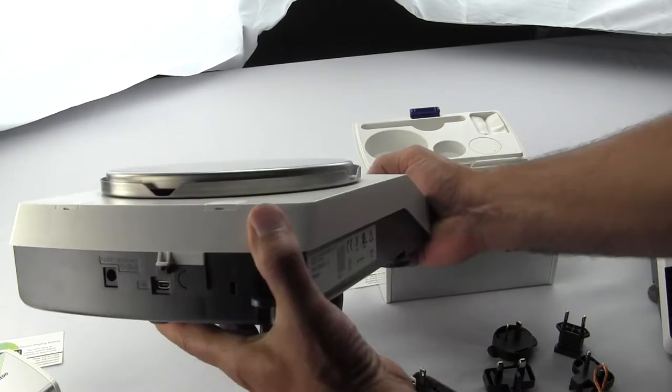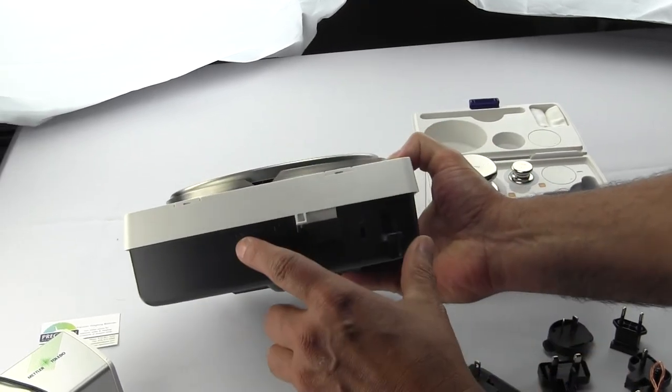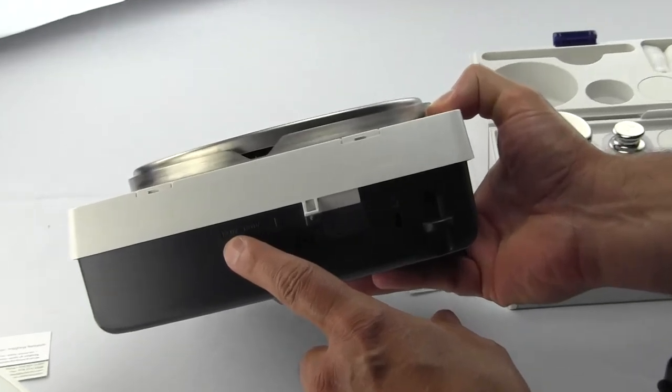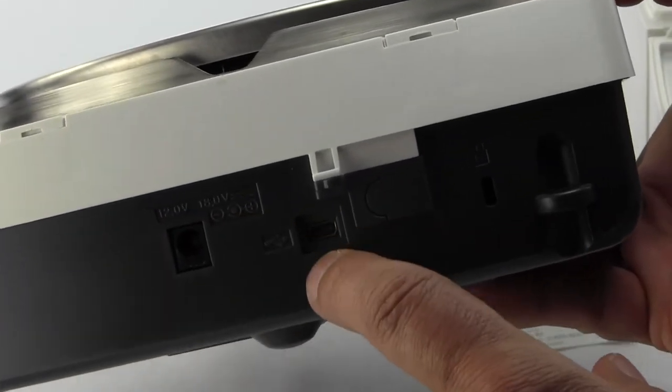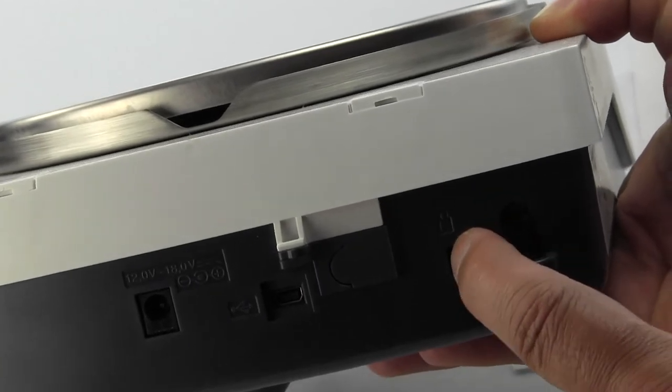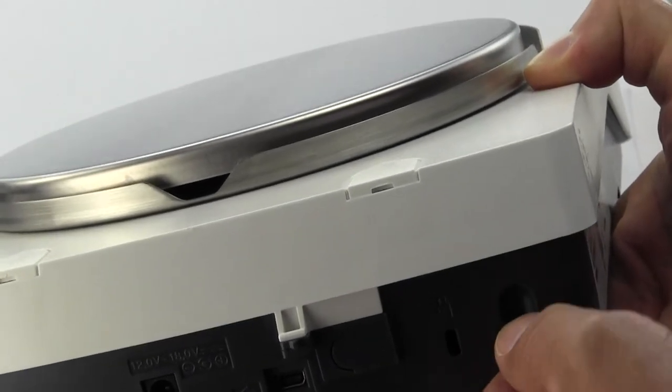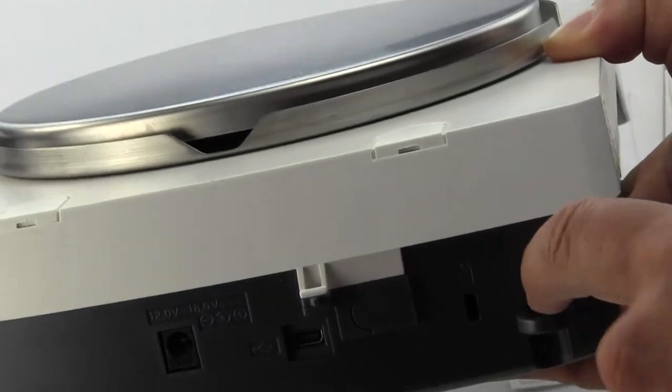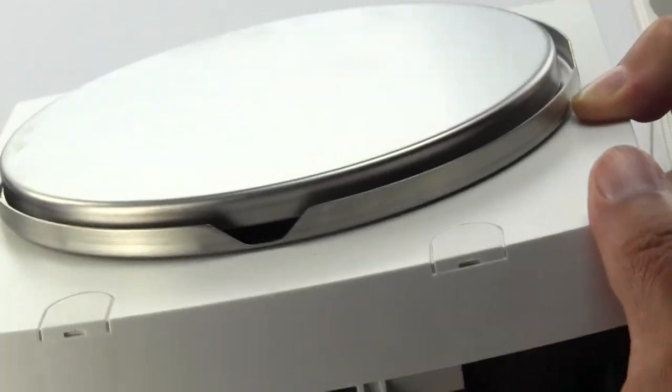On the rear of the balance, this is for your AC power supply, this is your USB interface. This is for a Kensington lock, or you can put a cable right through the back to lock it to a bench.